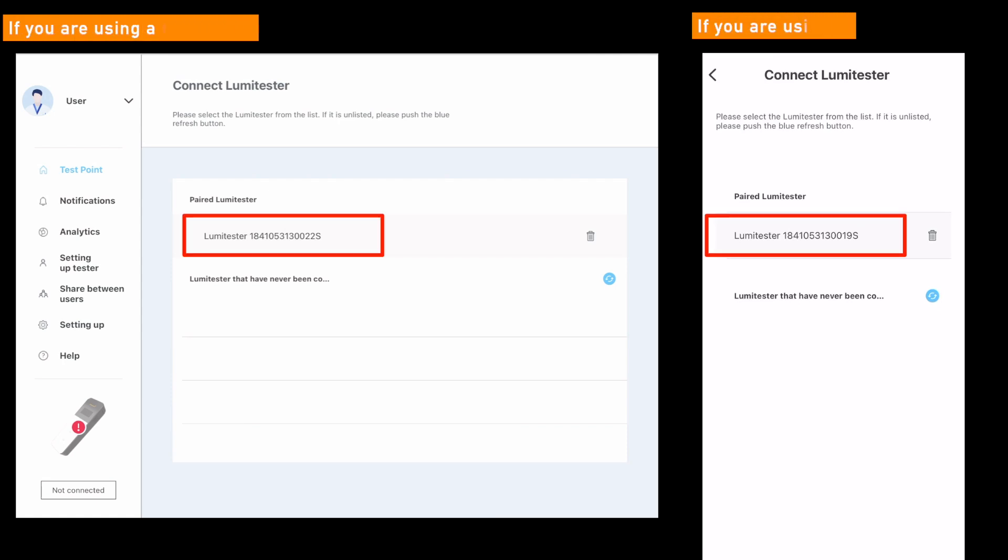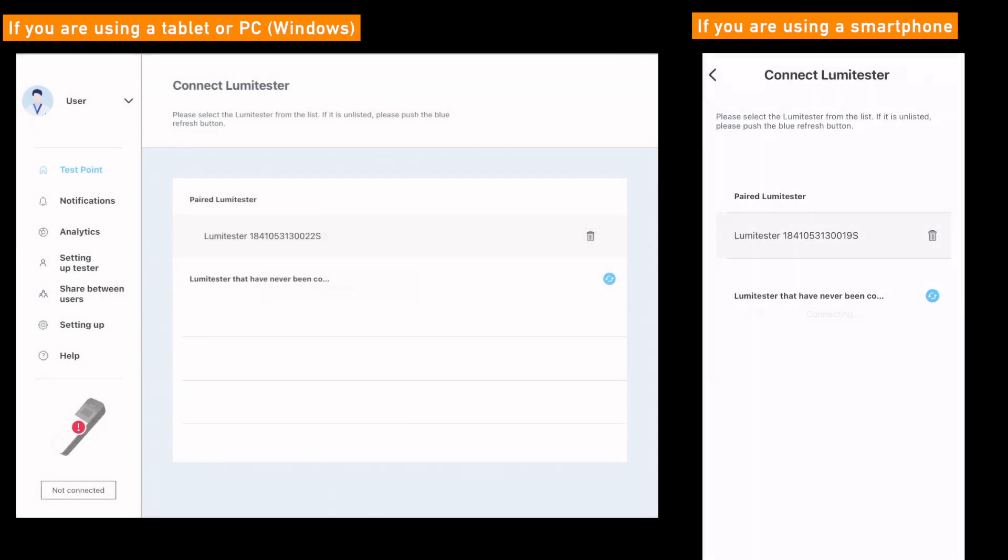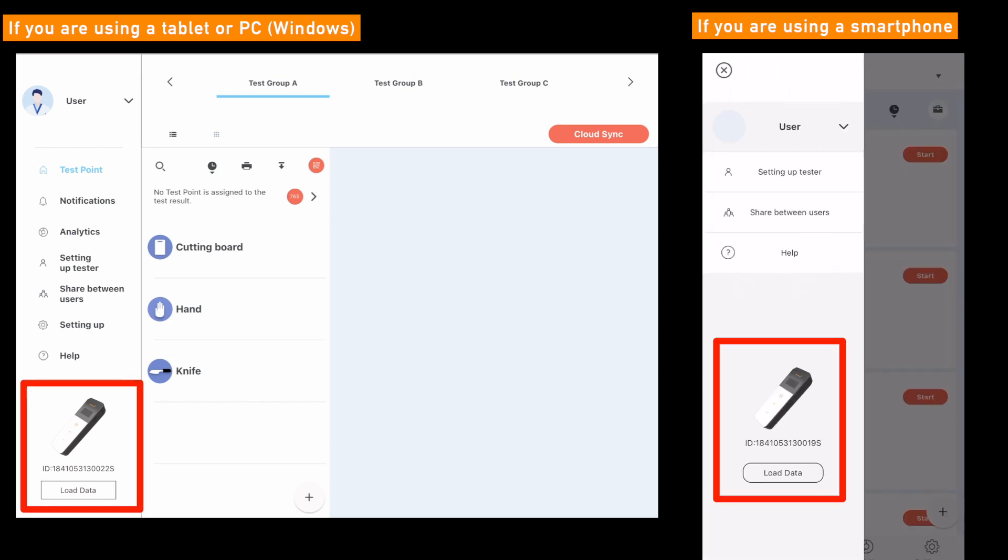If it is the second or subsequent connections, you can just click or tap the serial number displayed on the paired Lumetester to connect to your Lumetester smart. The instructions for downloading and setting up the Lumetester smart app are now complete.